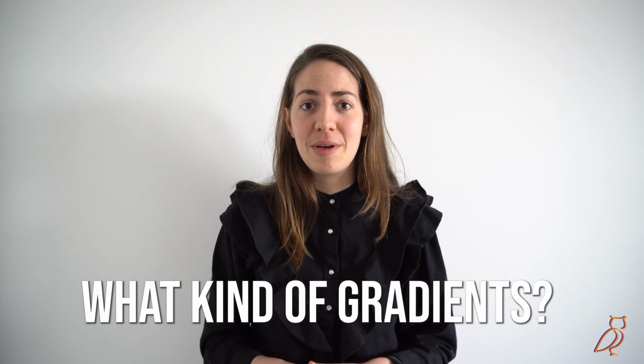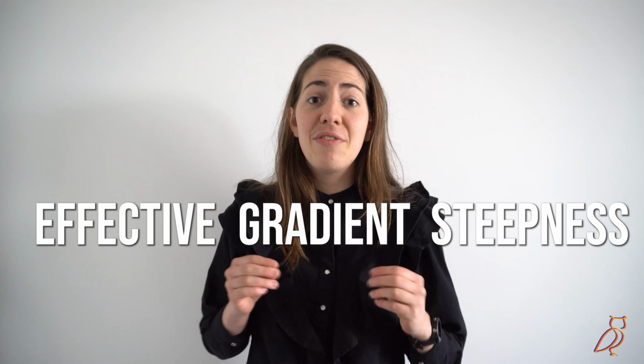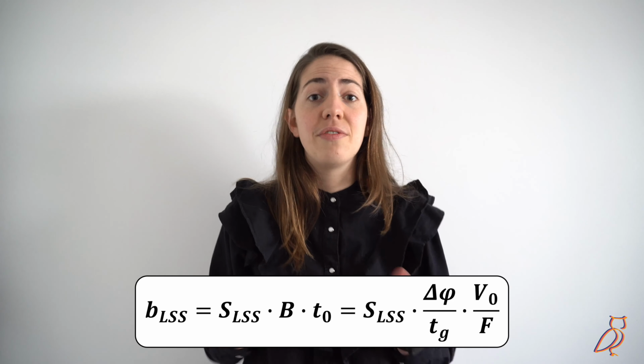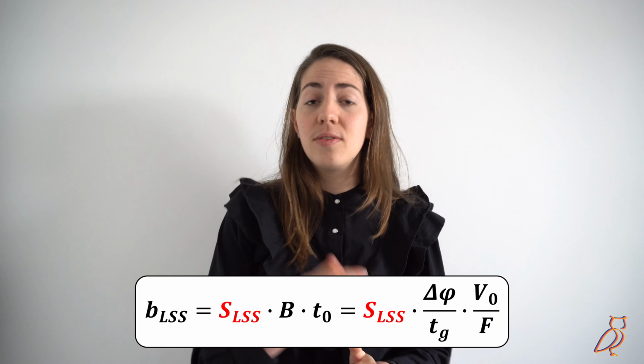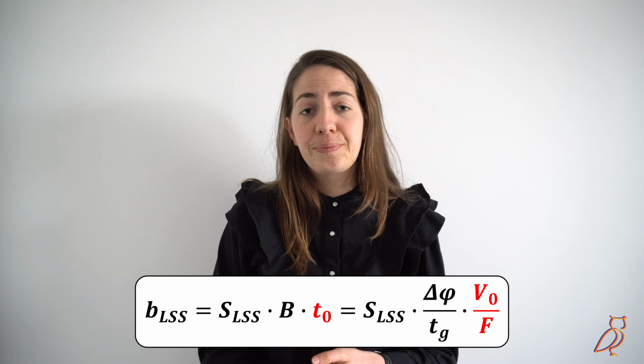So then of course the next question arises. What kind of gradients do I measure? The most important thing is that you have to vary the effective gradient steepness between your experiments. The effective gradient steepness can be described by this formula, which is the product of the slope of the LNK versus phi plot, described by S, the slope of the gradient, and the column volume.